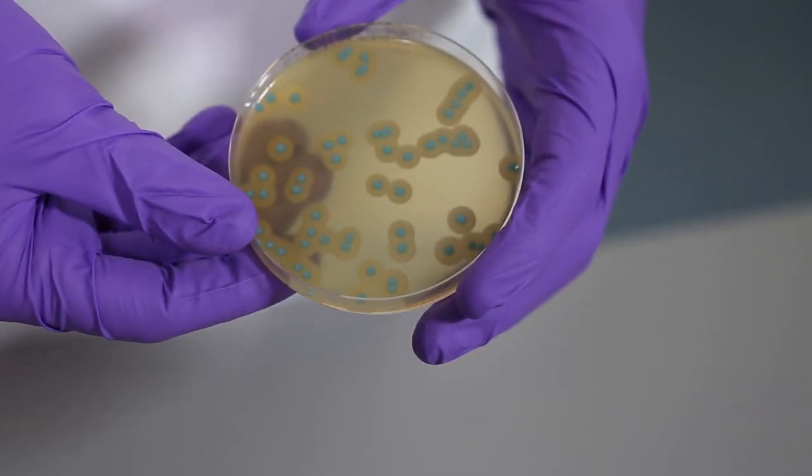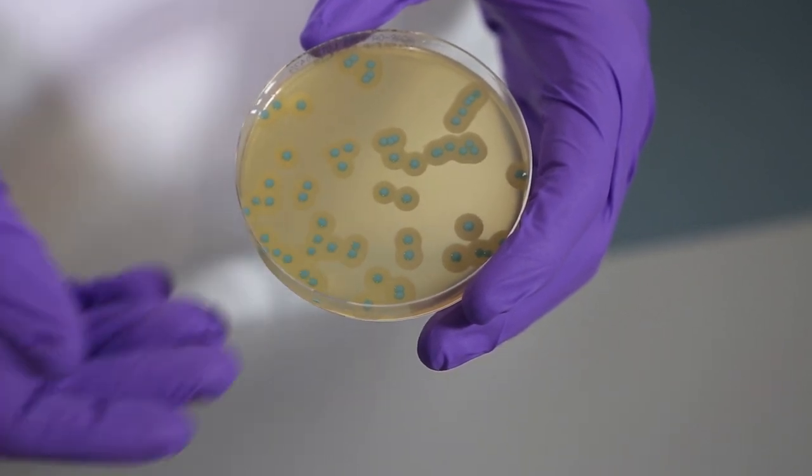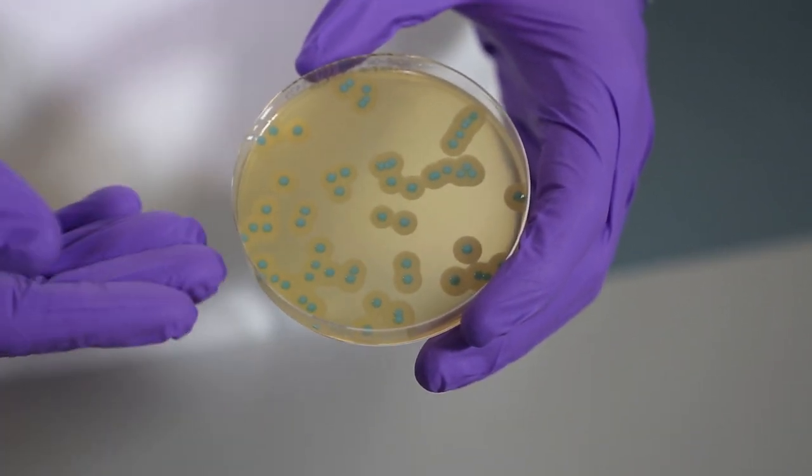This is what Listeria monocytogenes looks like on the agar when dried for around 10 minutes using a laminar flow. Here are healthy green colonies with large opaque halos.